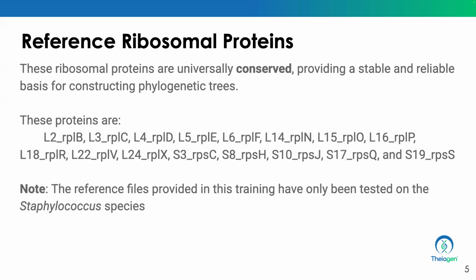We do have references for Pseudomonas, Campylobacter, as well as E. coli that she has pre-prepared. So if you needed to run this on those 3 additional pathogens, it should be possible. Currently, I'm testing this on some Vibrio references as well, to see if I can make the reference proteins myself, and then show you how to do that for your specific pathogen. Hopefully that works out as it's currently running, and we'll know in a few minutes if it did.